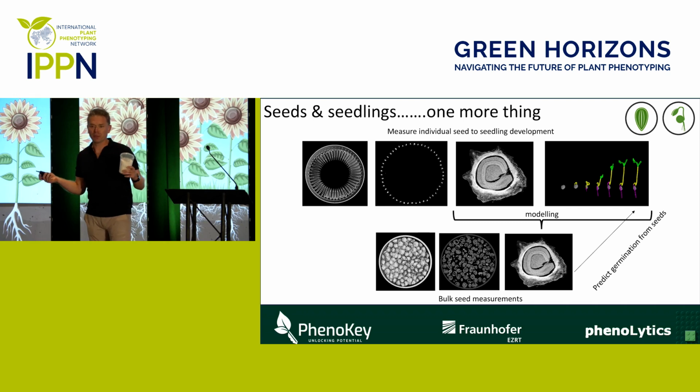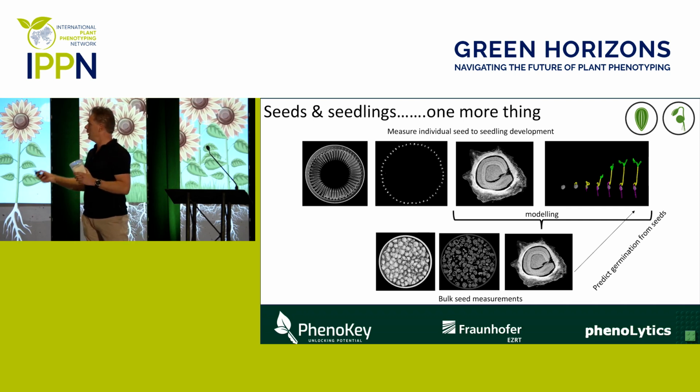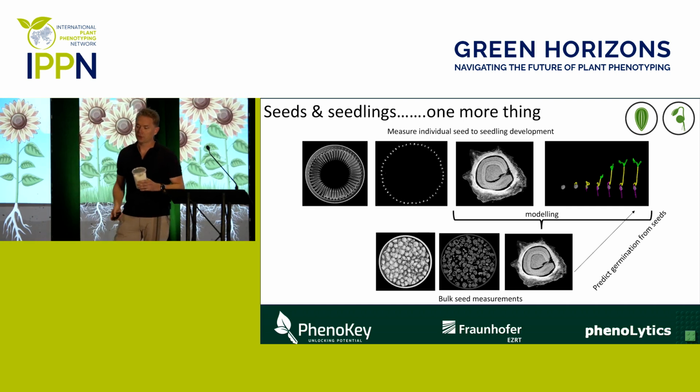That's the perfect base for modeling. So you know exactly on a seed to seedling basis how a single seed develops into a single seedling. And when you have that modeling, you can also apply that on seed measurements. So you only measure the seeds, and you can more or less predict what the resulting seedling will be.